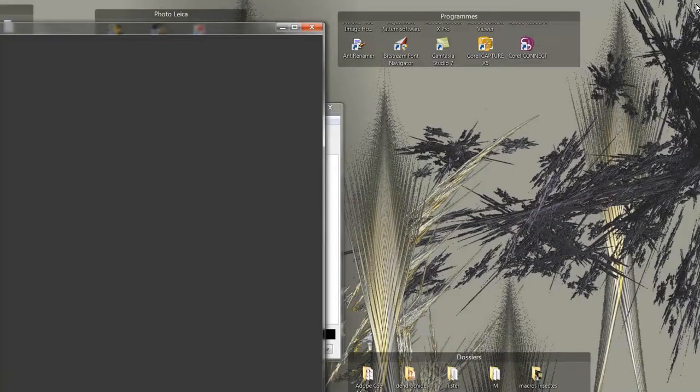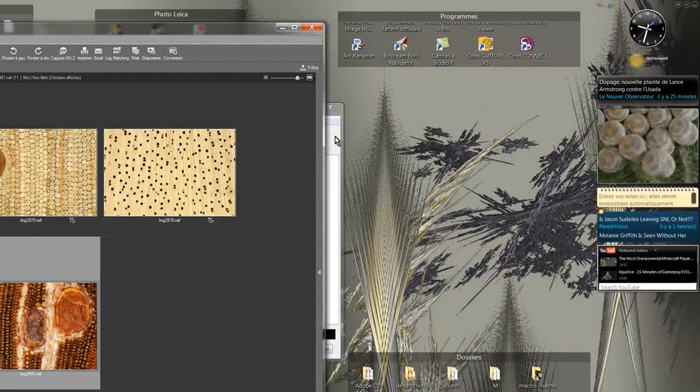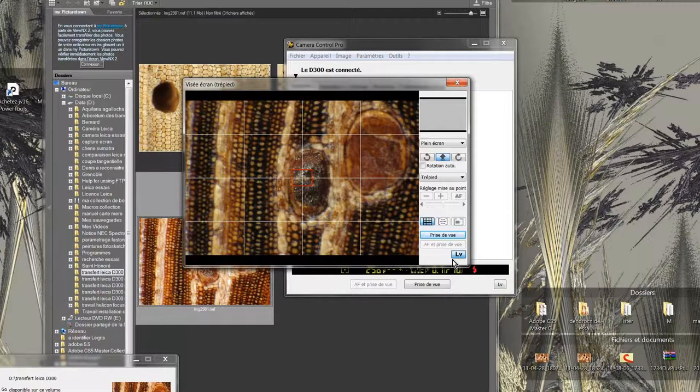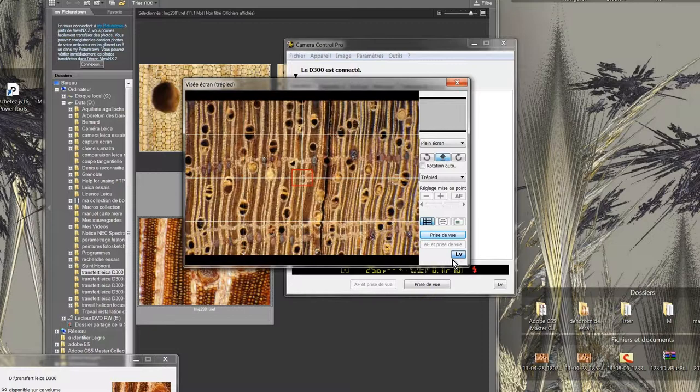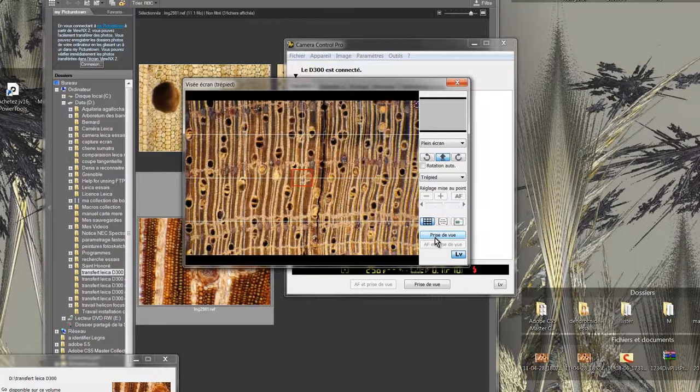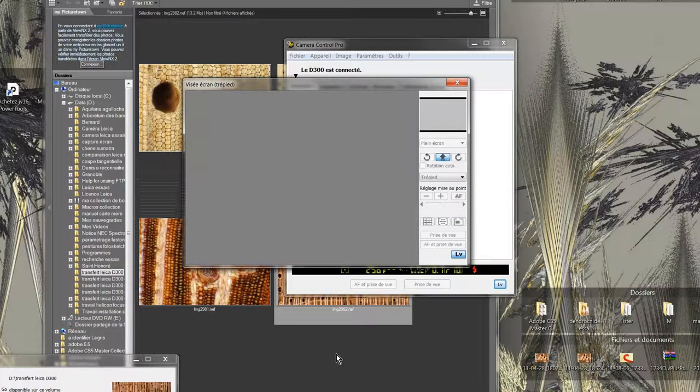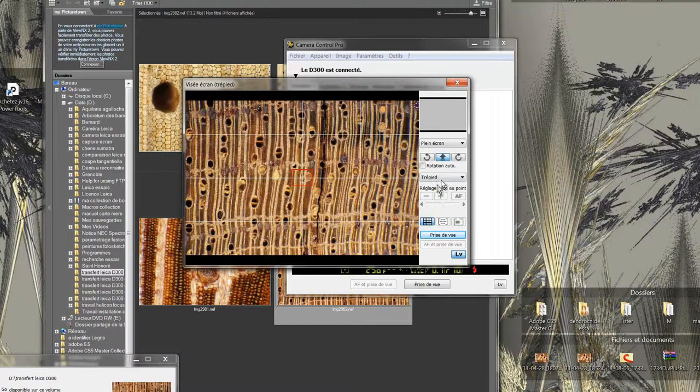Now I select the window of Camera Control to take my second shot. I set the magnification zoom on 10 times which corresponds to a very good magnifying glass. I take a new photo. Then I close the live view.